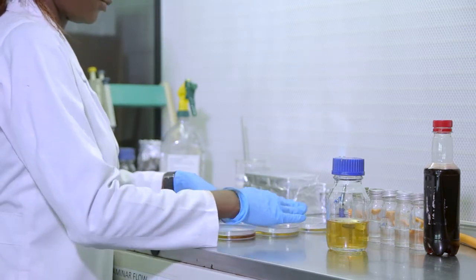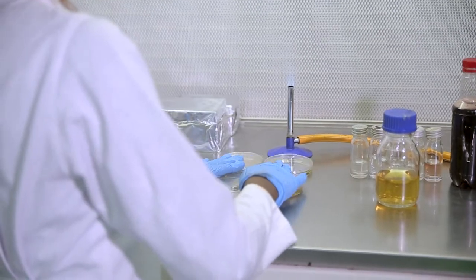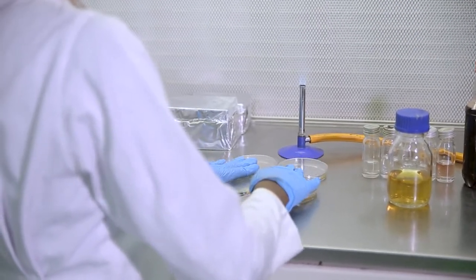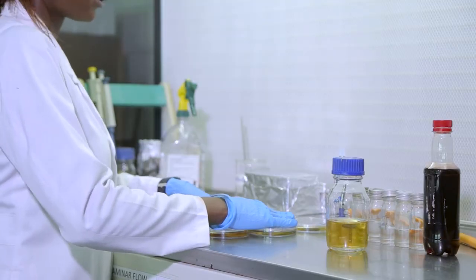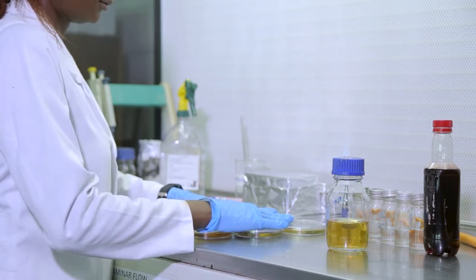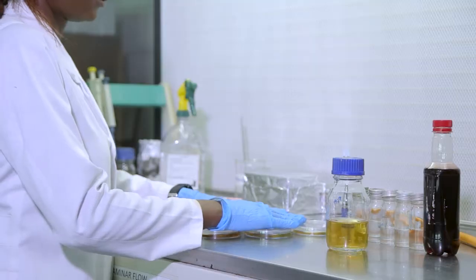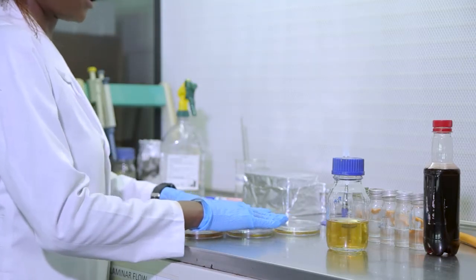So we make sure that we mix the inoculum and the agar. I could do anti-clockwise 7 or more times. Then I do clockwise. Then I can do north-south. 7 or more times is sufficient.